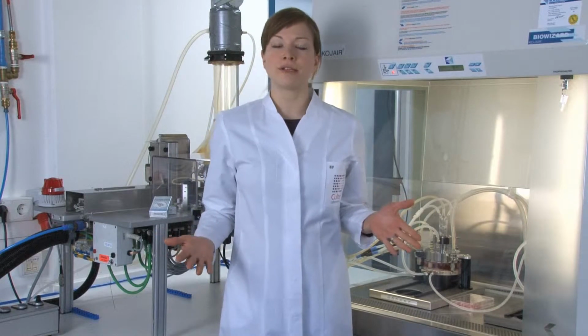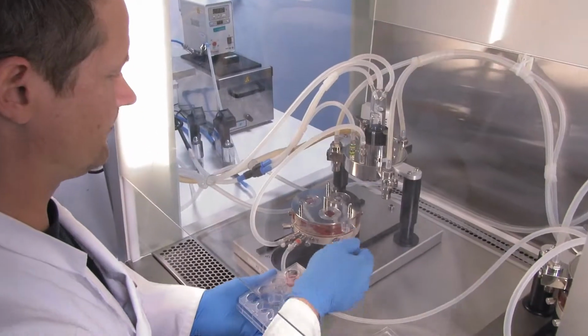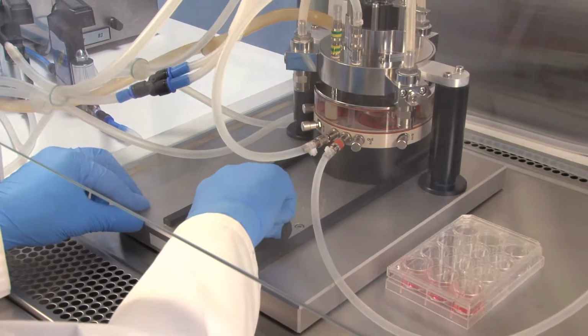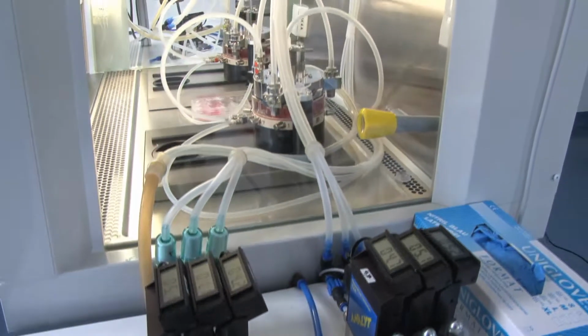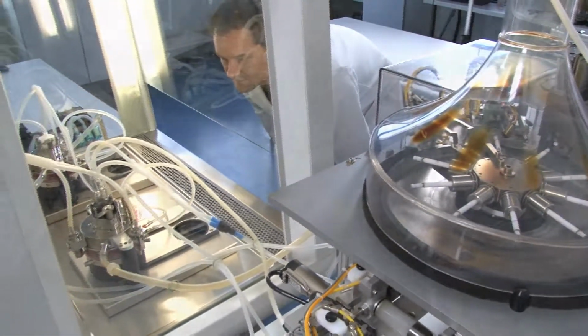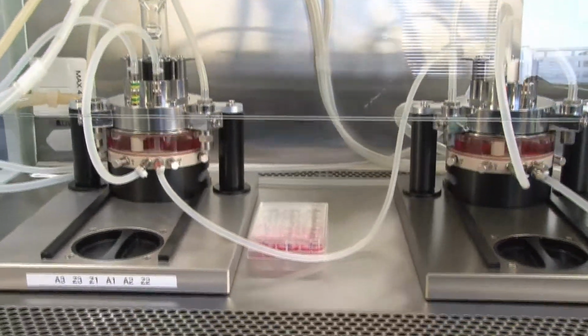The CULTEX RFS creates ideal conditions to study different realistic atmospheric situations, such as the effect of cigarette smoke or diesel exhaust fumes, for example. By computer-controlled smoking of cigarettes according to industrial standards, the use of the CULTEX RFS guarantees reproducible and consistent results.